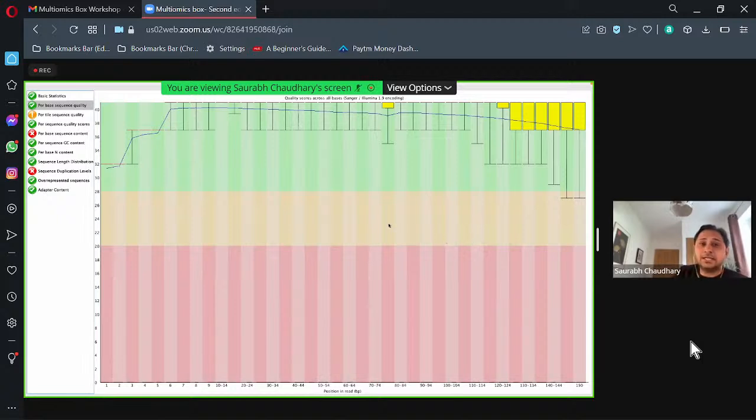You can use that data. It's not like it's bad quality data. It's average quality data. But if it is in the green, it's really good data. If it is in the orange, it's average data. You can use it. But if your data falls exactly in the red, that will not at all be accepted. My data is very clear actually. It's not coming anything here.